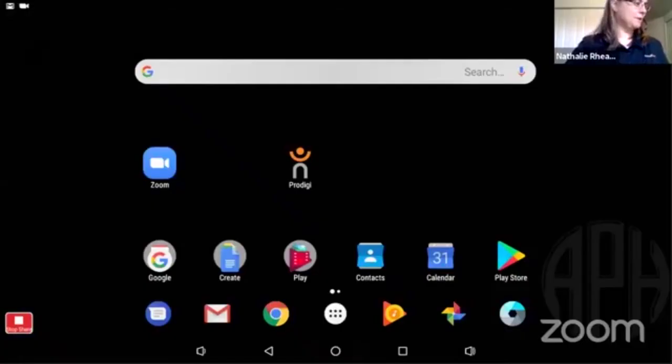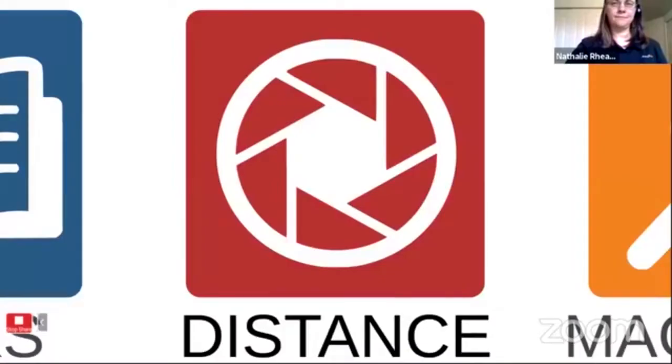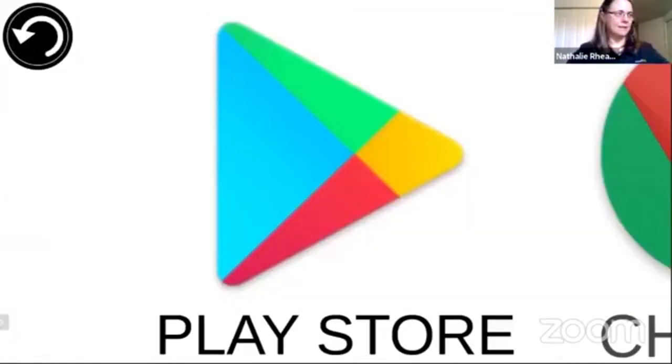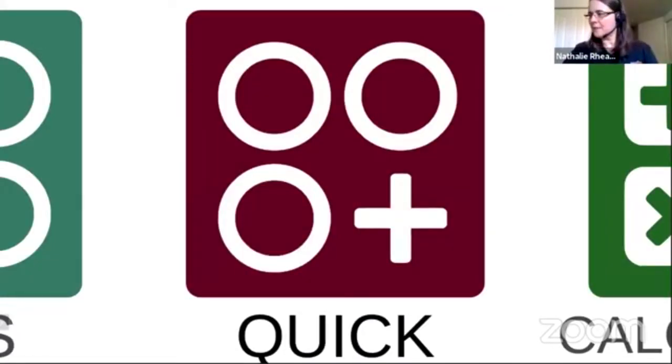So I'm going to go back in my Zoom, share my screen. Okay. Perfect. Yeah, so I'm back. I was finished with the quick access and the apps.